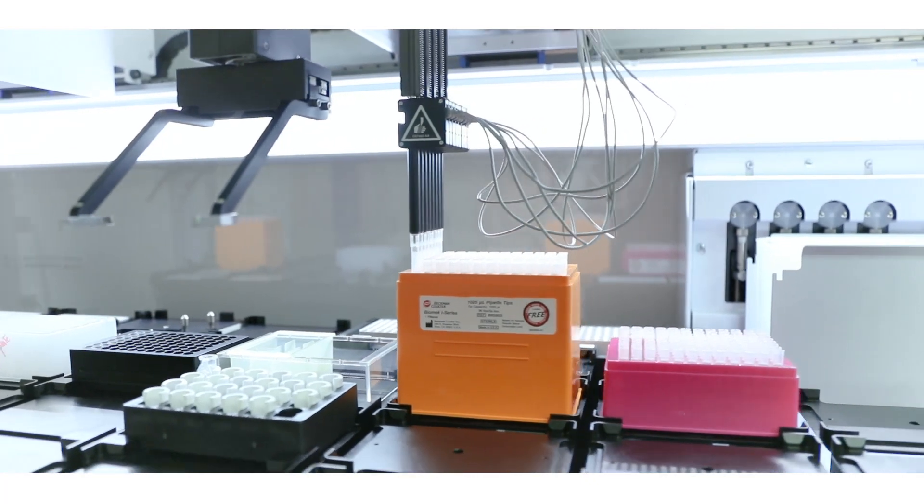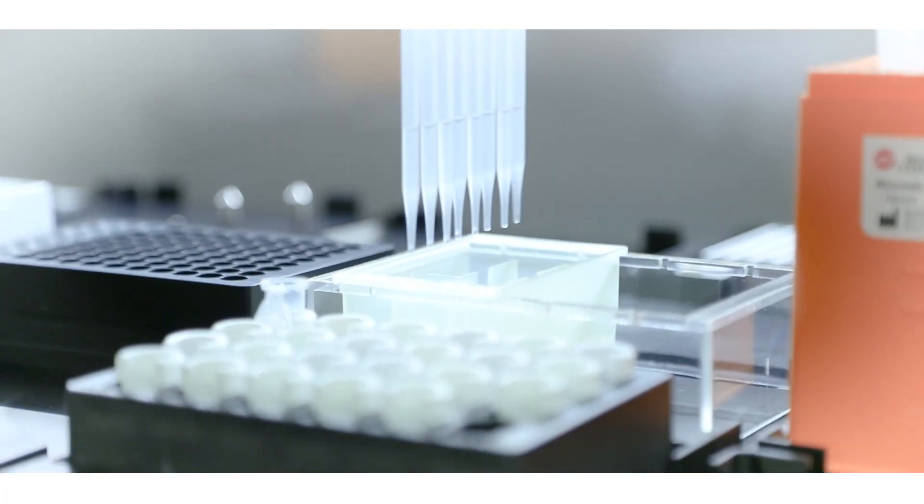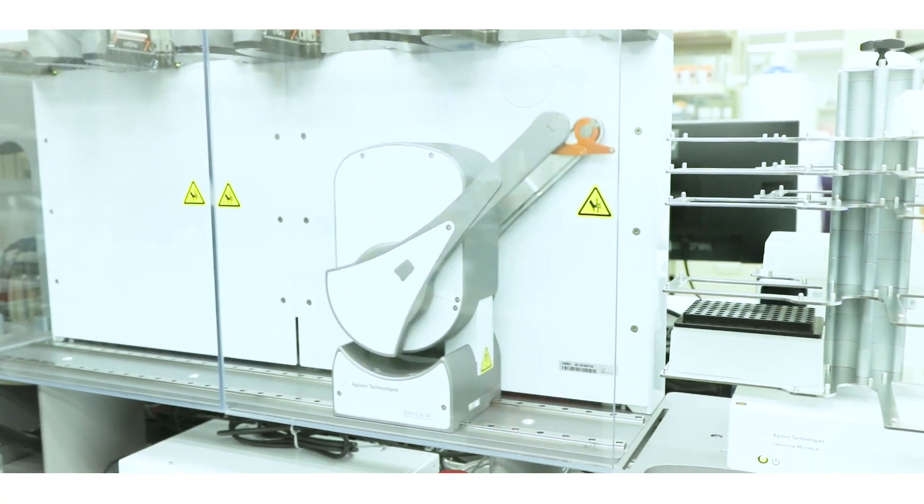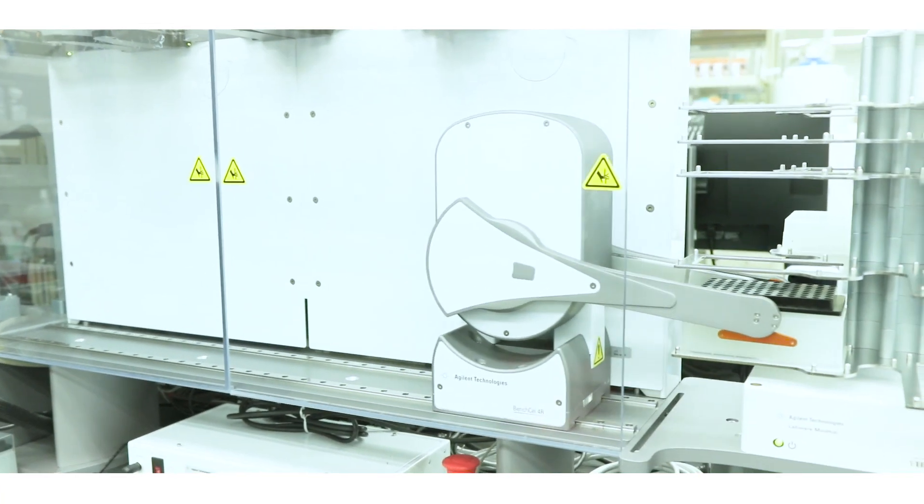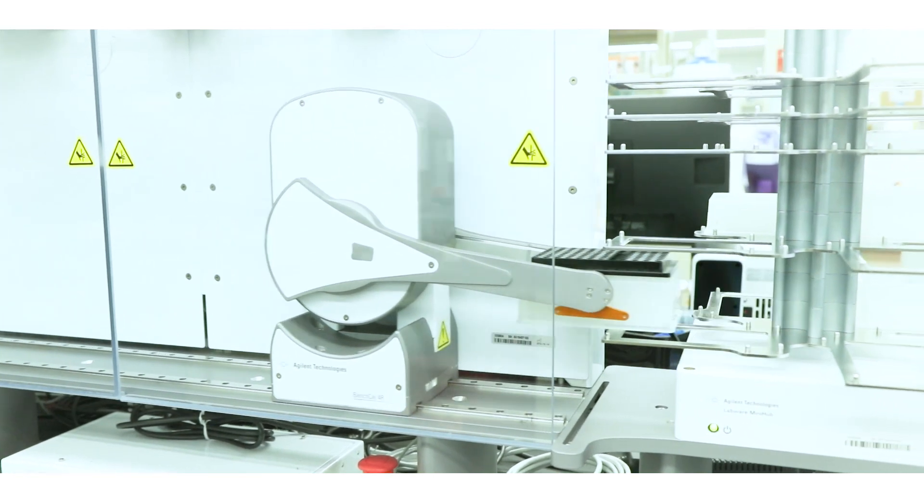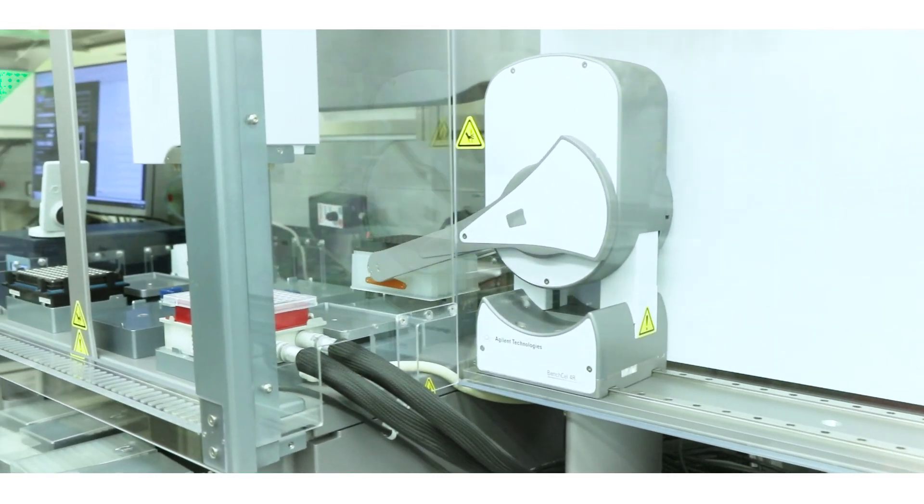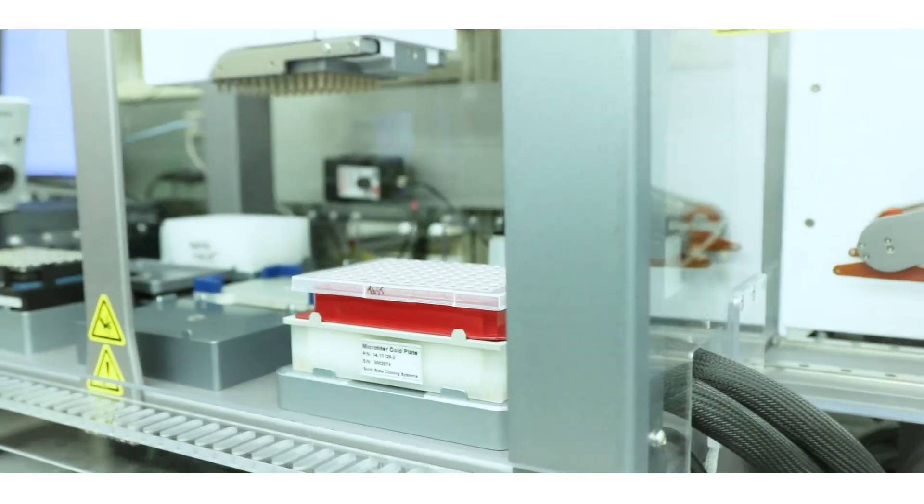Once we've taken those steps within the lab and done all of that work, then we can start our library prep. So library prep is different for our RNA-based assays as for our DNA-based assays, but we've got a lot of robotic systems that we've put in place to be able to perform those assays as quickly as possible.